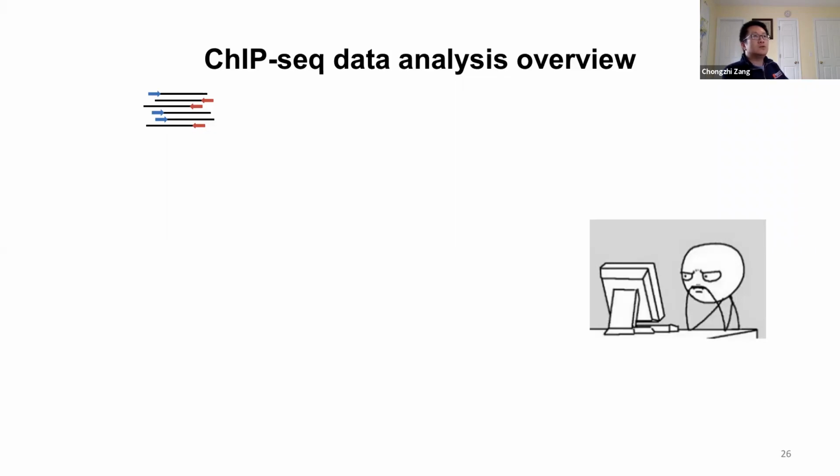To determine whether you want to go with single end sequencing versus paired end sequencing, there are a few more factors to take into account besides the cost, depending on the biological question you are asking and the targets you're looking at. But that's a very good comment.